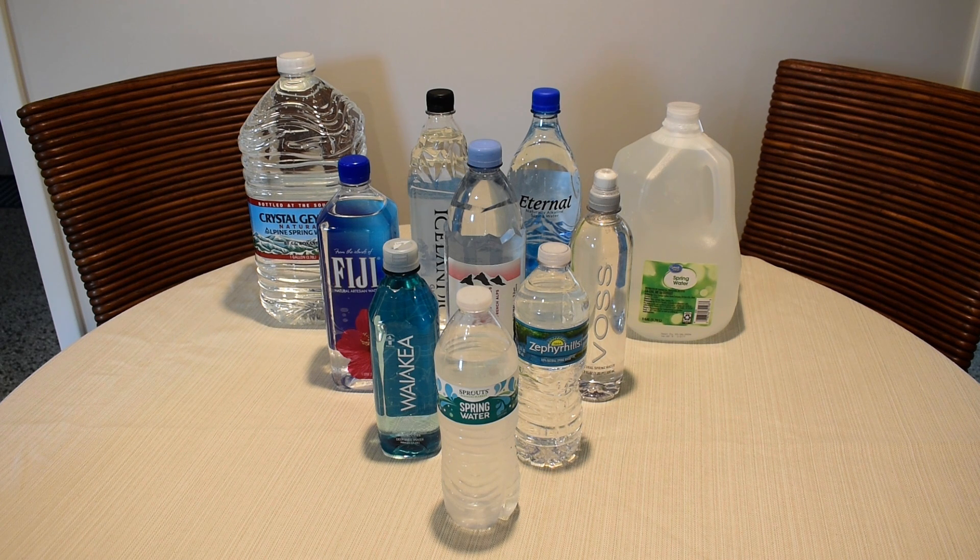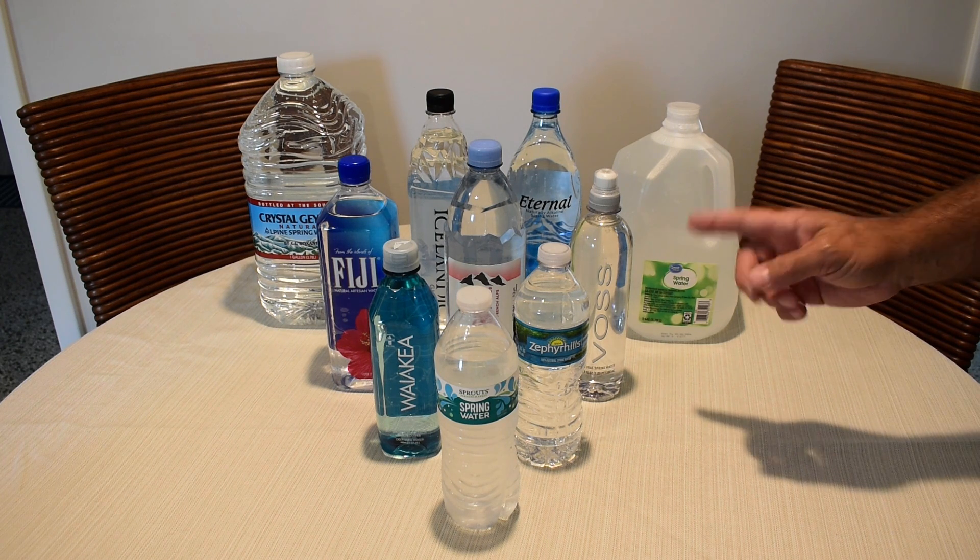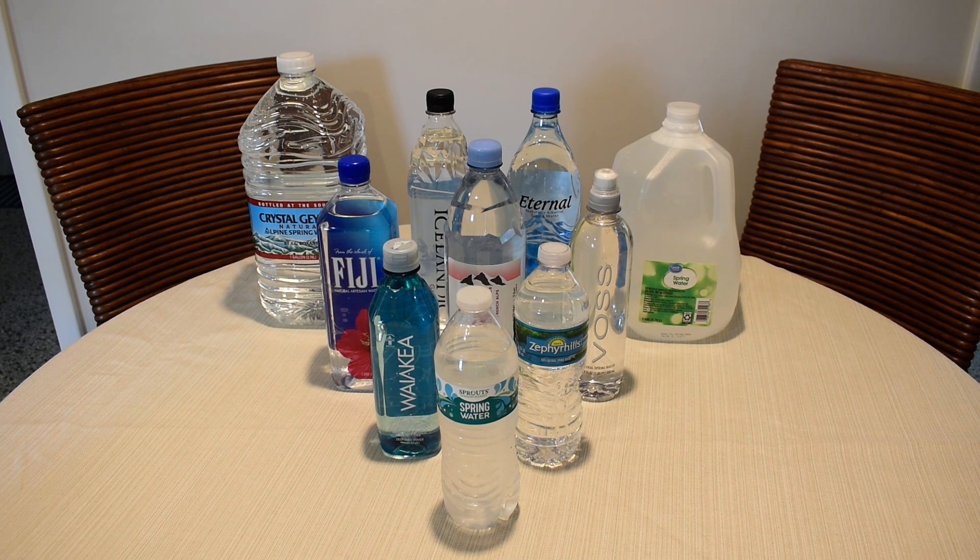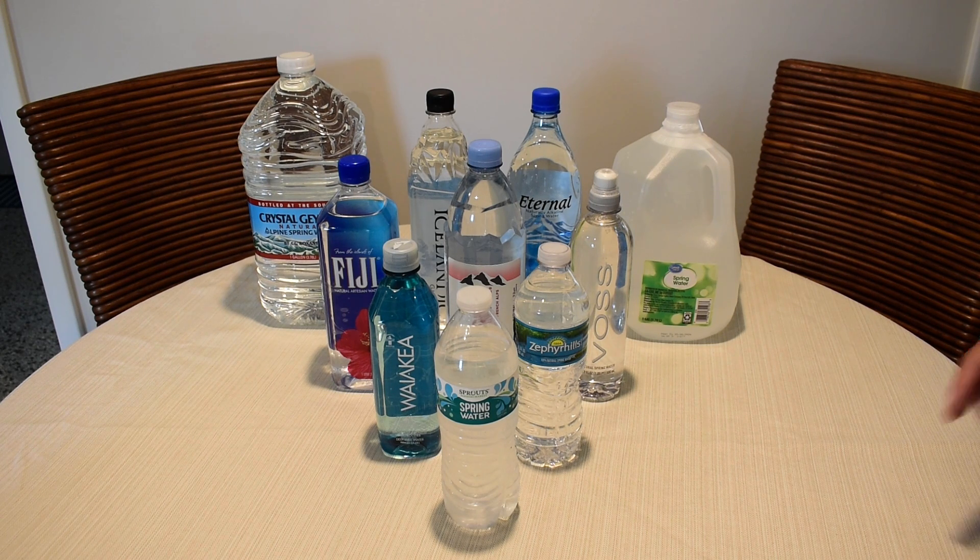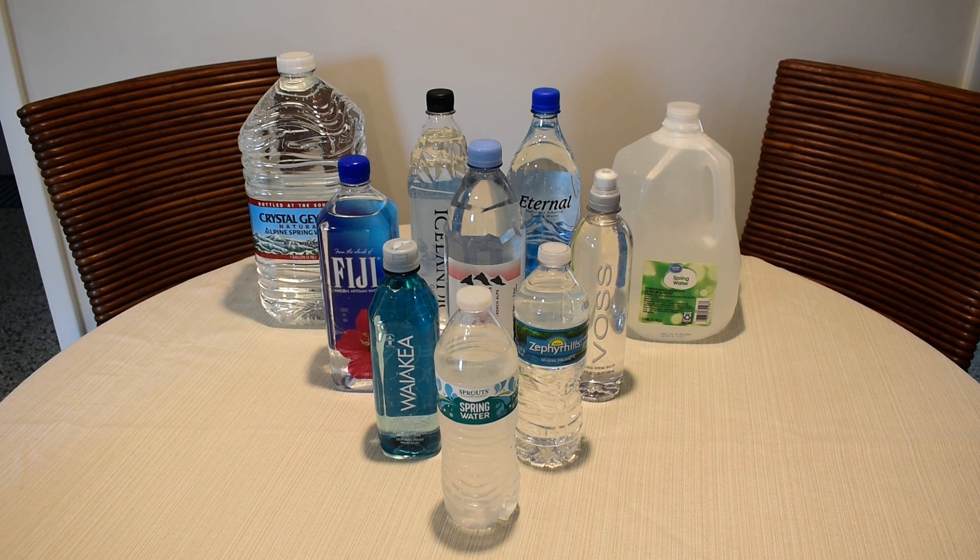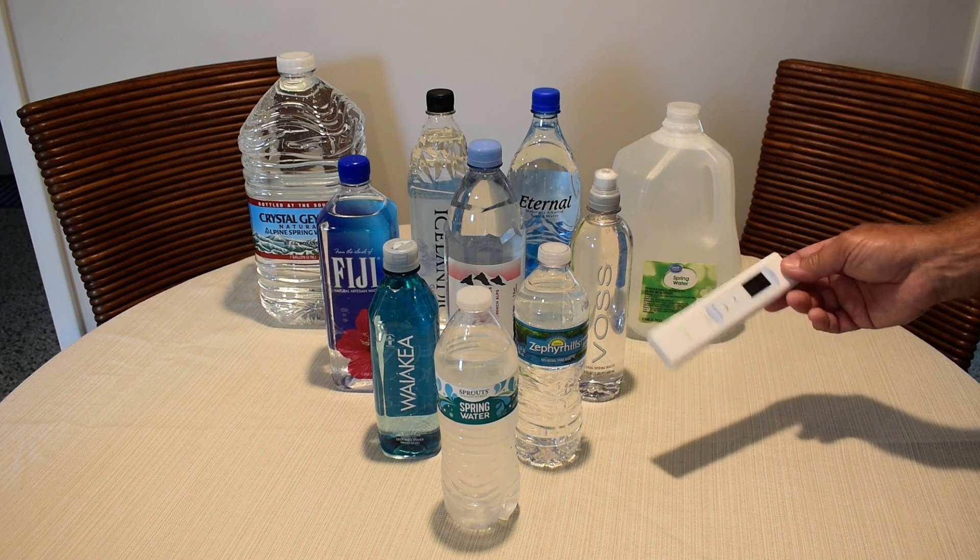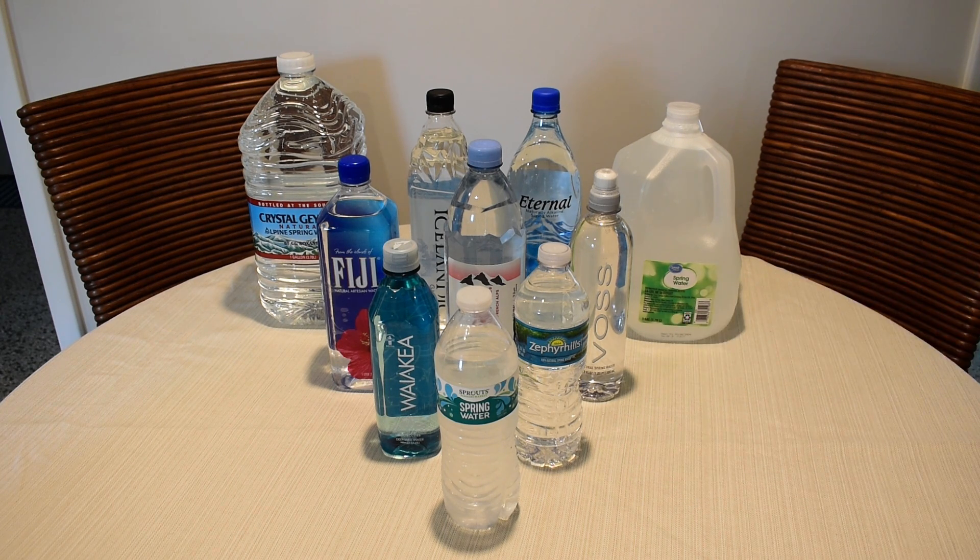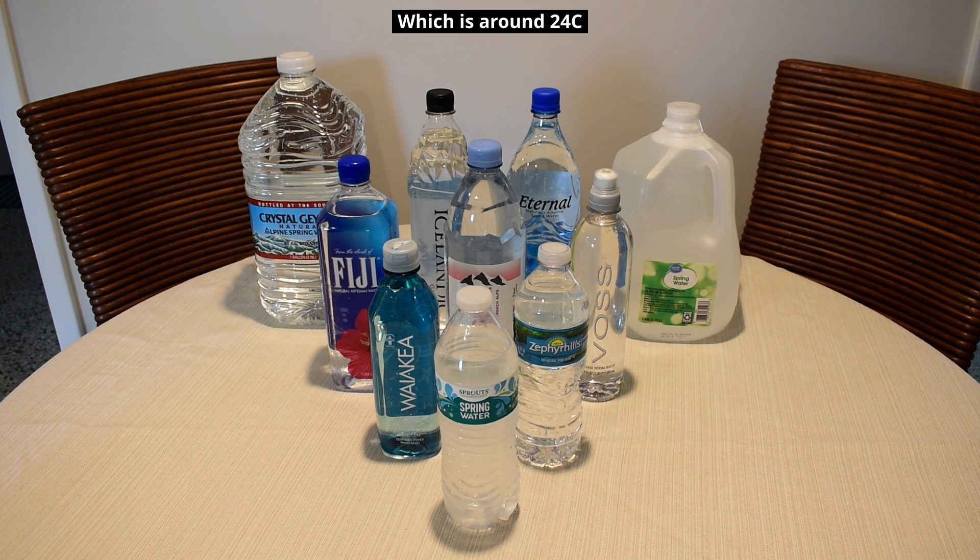And the last test we will be performing is for EC, or electrical conductivity. Ideally you want to have an electrical conductivity value that is as low as possible. Higher values would indicate more impurities in the water. This tester also has the ability to measure the temperature of the water, but we won't be looking at that test. All of these are at room temperature, around 75 degrees Fahrenheit.